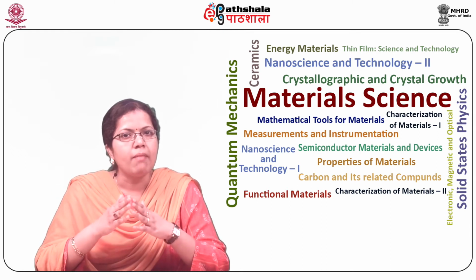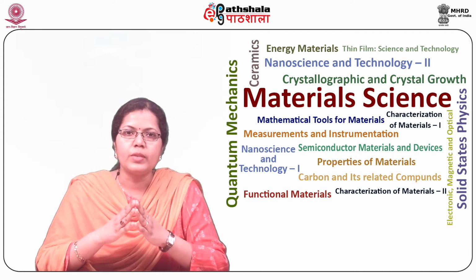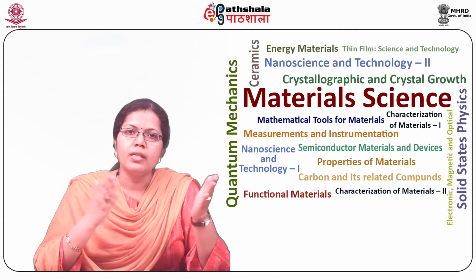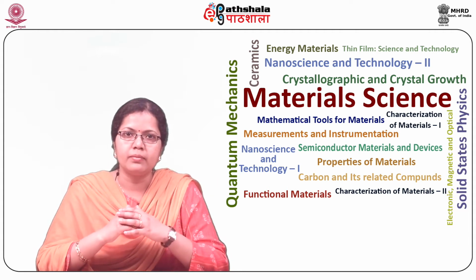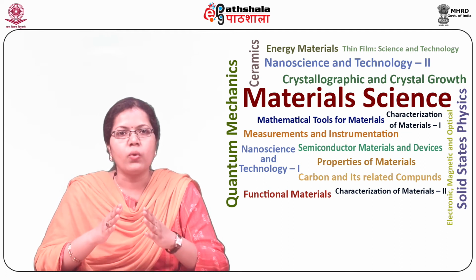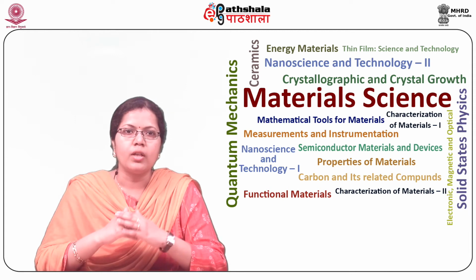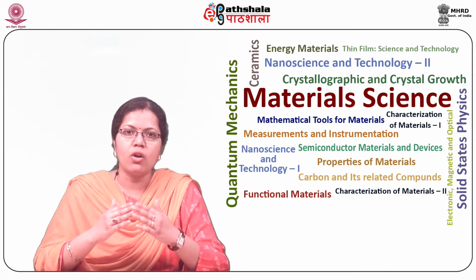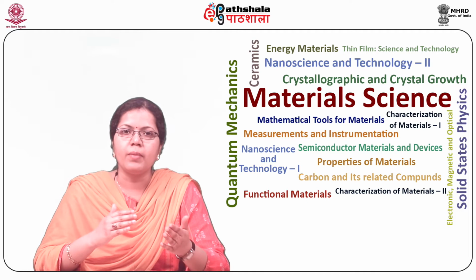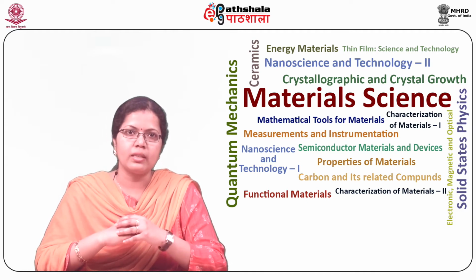These variations manifest themselves as colors when the two dispersion plots intersect for some visible wavelength. It is an optical staining method which does not require any stain or dye for producing colors. The most popular application of this technique is for confirming the presence of asbestos in construction materials.